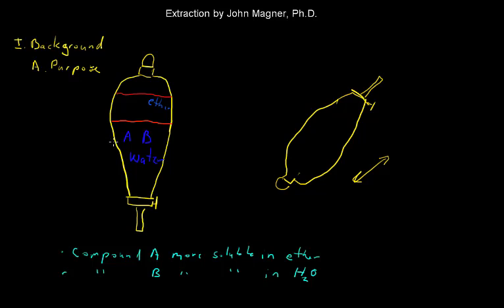And often that's exothermic. And solvents like ether have relatively high vapor pressures. And so when you're doing the shaking initially, there's a little bit of warmth created, and that really increases the vapor pressure inside the separatory funnel. That can cause the stopper to pop off even if you're gripping it really tightly, or leak. And in those cases, you lose some of your solution. It gets on your hand, and that's kind of a mess.